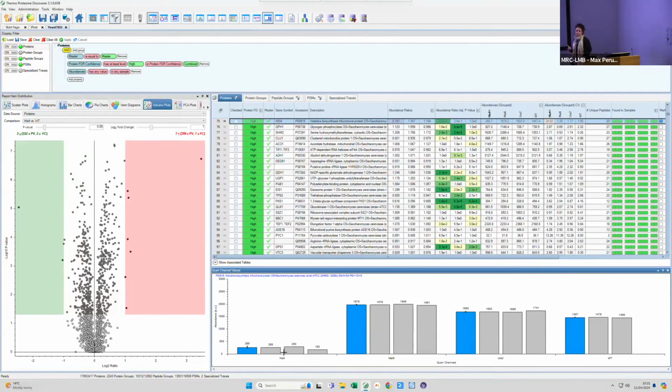How good, how bad, we don't know that. There might be a technical reason why we're actually seeing a value in there, and this is basically related to the mass spec itself. When you're selecting to do the peptide identification and then the fragmentation of those to see the reported abundances, in some situations we'll have co-isolation of different peptides, which means that you think you're isolating one specific peptide, but a couple of others also fall very near in terms of the mass over charge ratio.